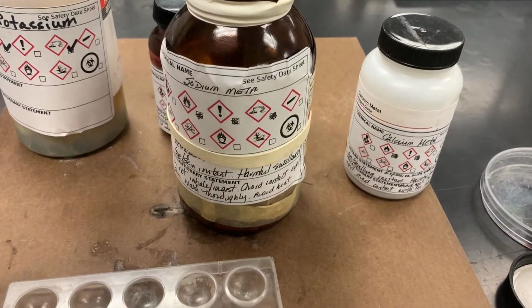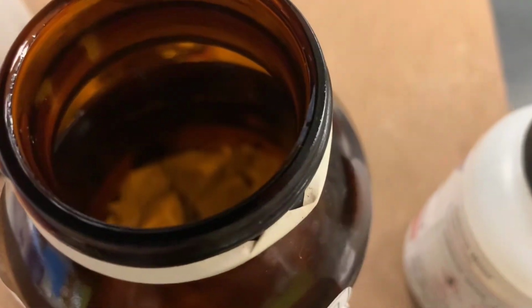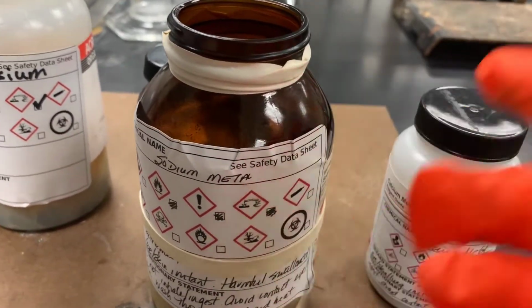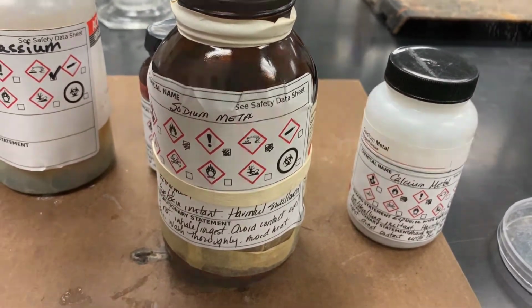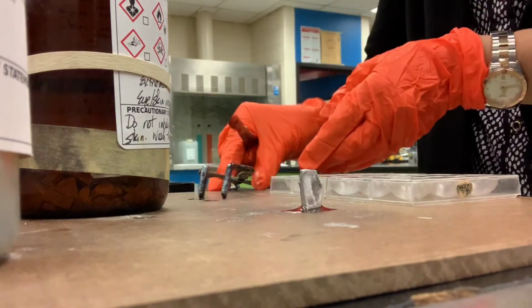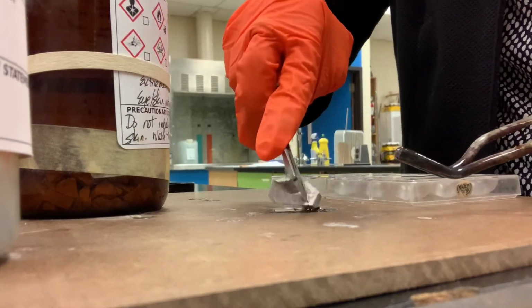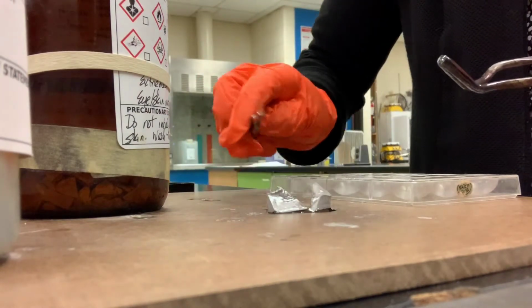I'm going to cut a piece of sodium metal, and you can see that the sodium metal is kept in mineral oil to prevent it from reacting with the moisture in the air, and it's kept in this darker container to prevent it from reacting with the UV light. So I'm going to cut a piece of this sodium metal, and you're going to see that when it's cut, it's actually quite soft, but it's very lustrous as well.